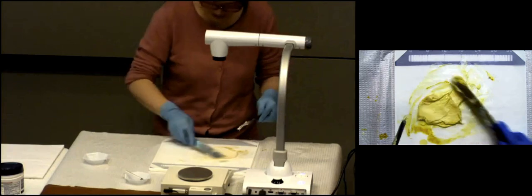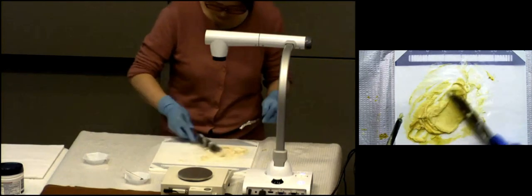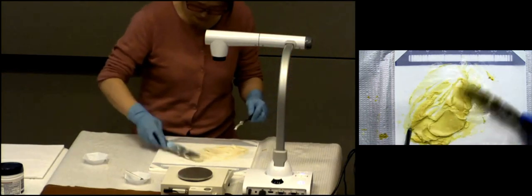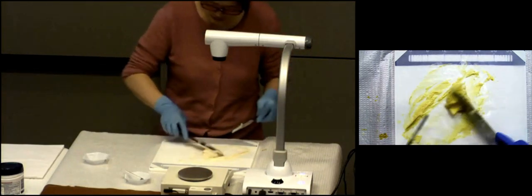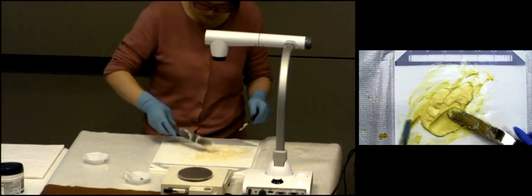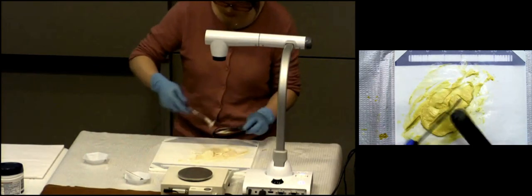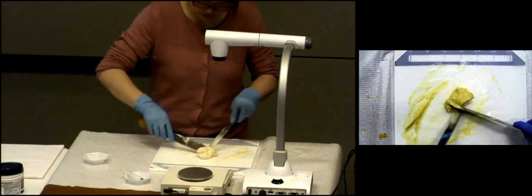So as she's finishing up on that, what I wanted to get through is look at steps 6 and 7. There are 5 points on the exam in those 2 steps alone. You miss any one of those 5 things, you can lose up to 5 points. So realize step 6. Circle the words 30 grams. Circle 1 ounce. Circle ointment jar. Because you need to say to transfer how much? 30 grams. To what size? 1 ounce. Saying what? Ointment jar. 3 different parts to that one sentence.